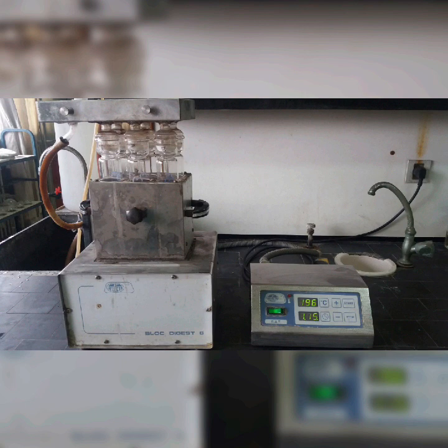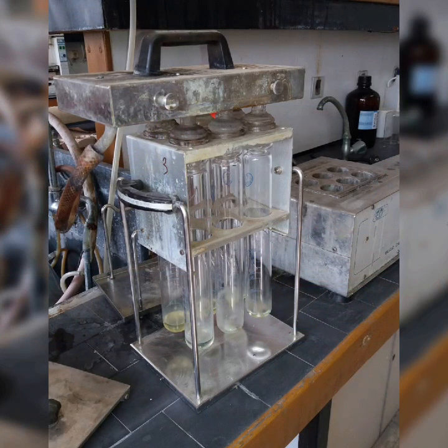But here's the twist. The reaction needs a little help. This is where catalysts, or helpers, like copper sulfate or selenium come in. They speed things up, making sure all organic matter is fully digested. Picture it this way. If the sample is a locked box, sulfuric acid is the key, and catalysts are the oil that makes the lock turn smoothly. Once digestion's done, all the nitrogen in your sample is now ready for the next stage, liberated as ammonium ions waiting to be measured. On to stage 2, distillation.